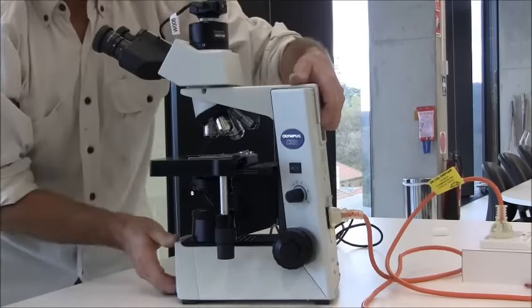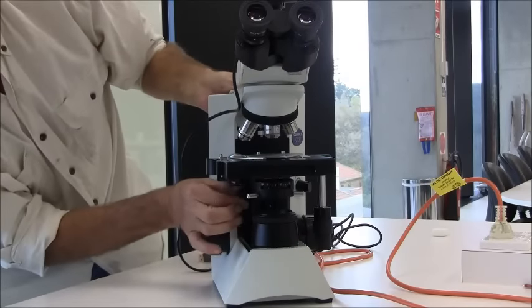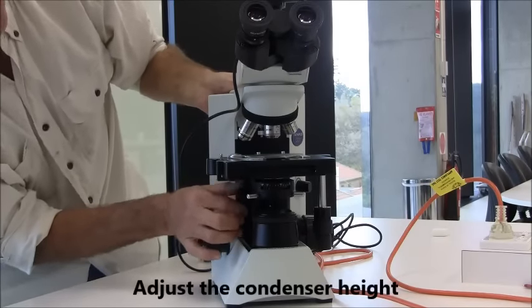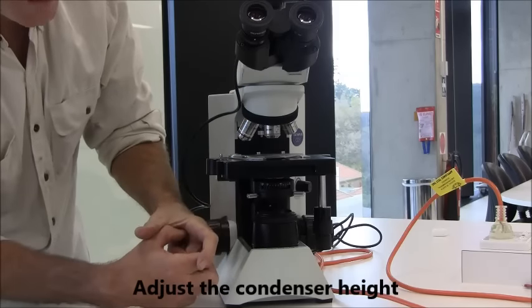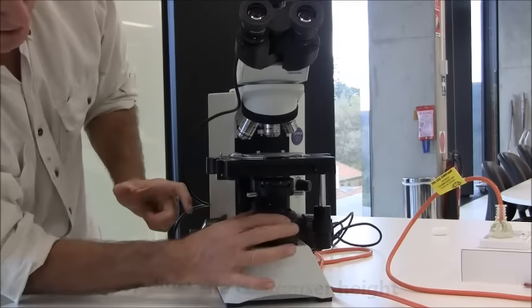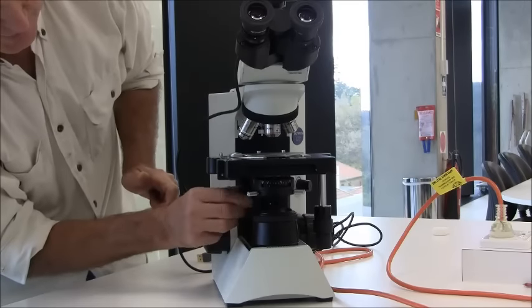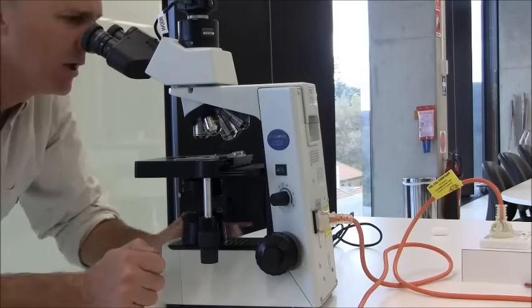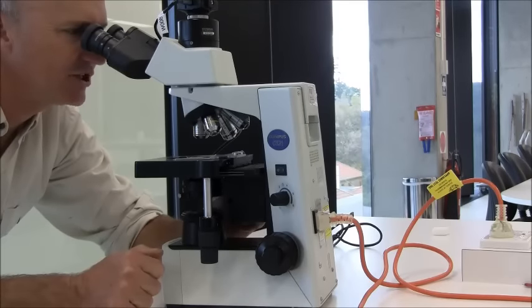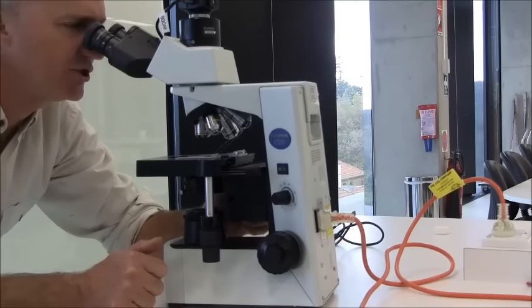Then, looking down the microscope, you adjust the condenser up and down until that shadow, that closed ring you've produced by rotating this dial, is sharp. So that is the focus of the light source. So I'm going to get that nice and sharp, as sharp as you can.